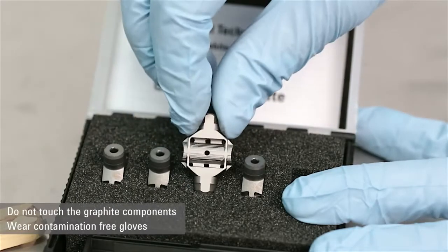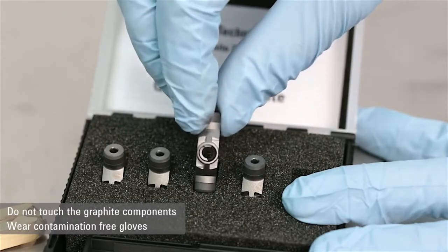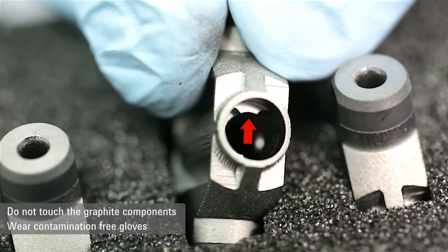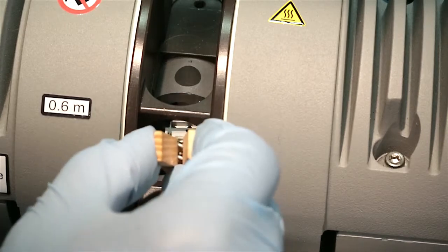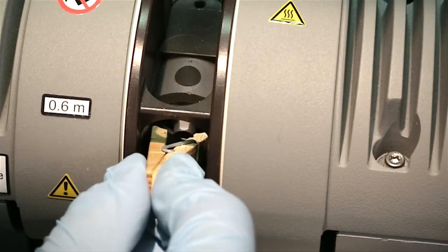Orient the tube and verify that the side of the tube securing the platform is on the left-hand side of the furnace. Using the insertion removal tool, place the graphite tube into the rear contact.